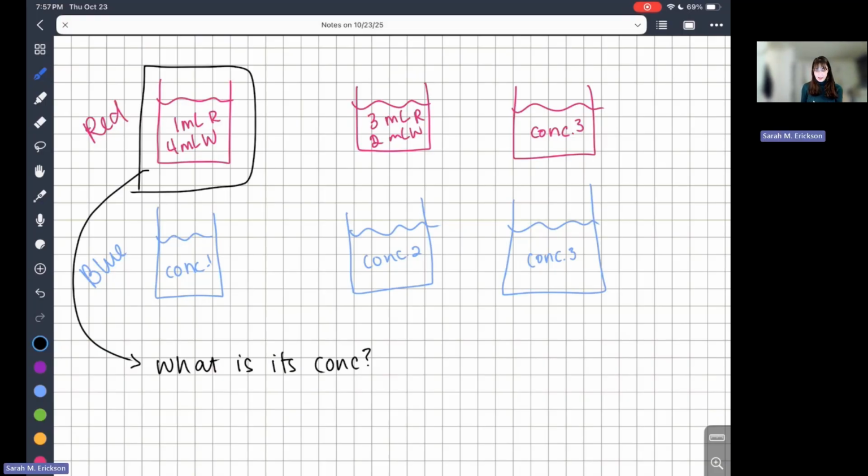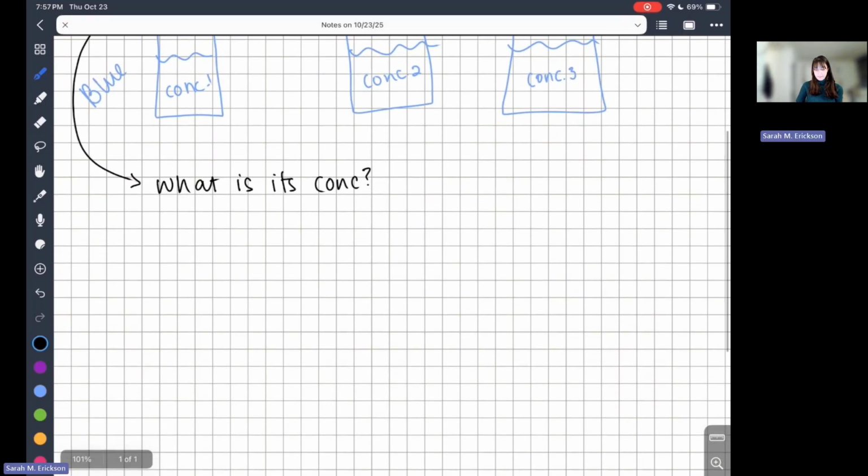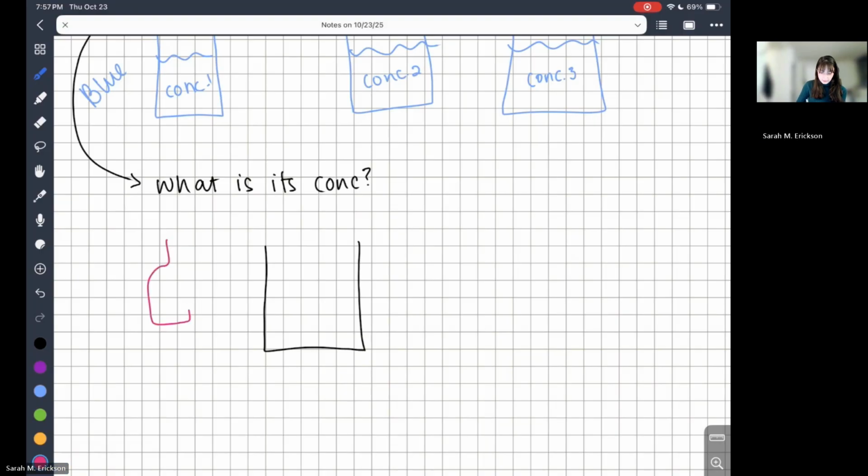Okay, so when you were in lab and you made this solution, you took a beaker and then you took the stock solution dye. So maybe this was red number 40 that was available in lab. Maybe its concentration was like 10 to the -6 molar, right? So you took this and you took 1 milliliter of it and put it into your beaker.